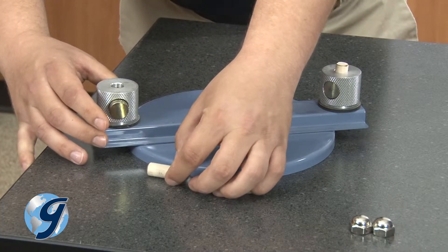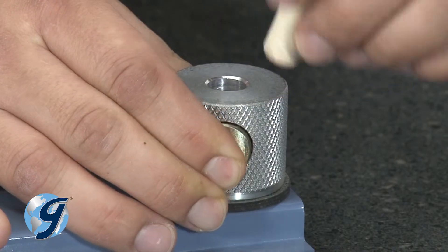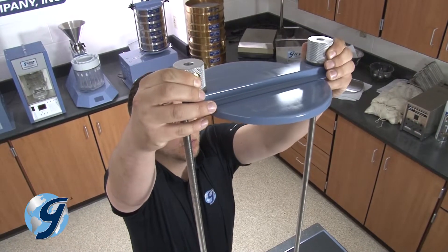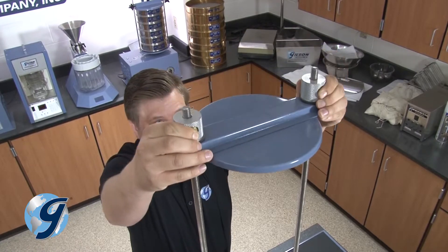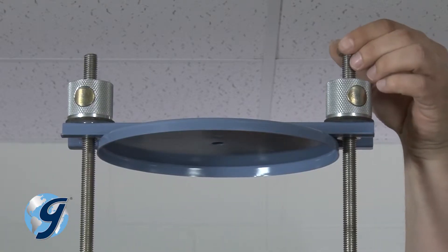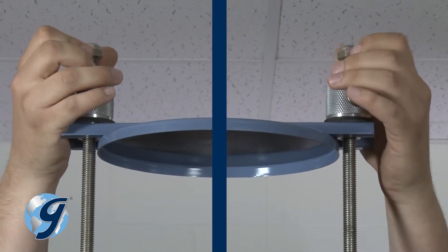Now remove the spacers from the knobs. Next, insert the compression sleeve onto the rods while depressing the push button. Set to desired height and release the button. Now secure the acorn nuts to the top of the rods.